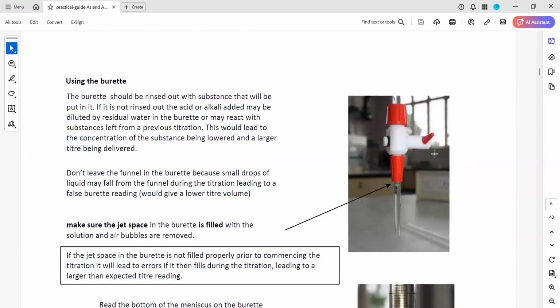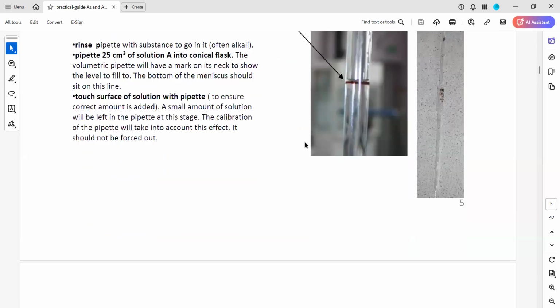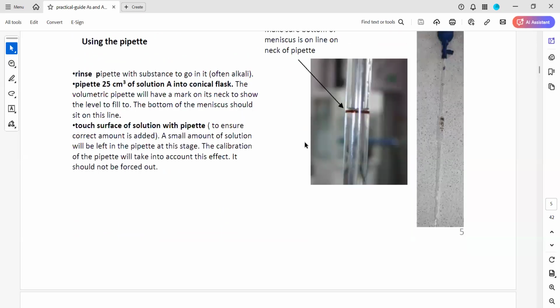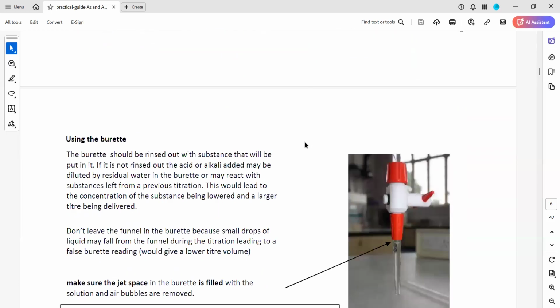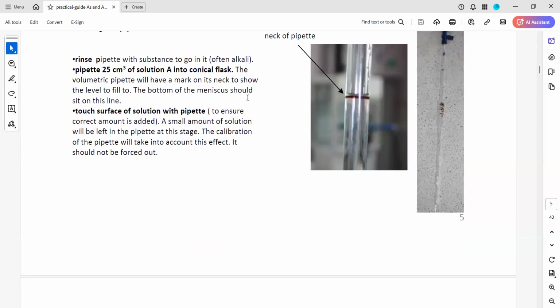You can see this is a burette. So the burette should be rinsed. Why rinse? Because maybe other reagents are there, to remove them or to remove the inaccuracy. That's why it is rinsed. In experiments we use the substances and apparatus many times, so we always rinse them.